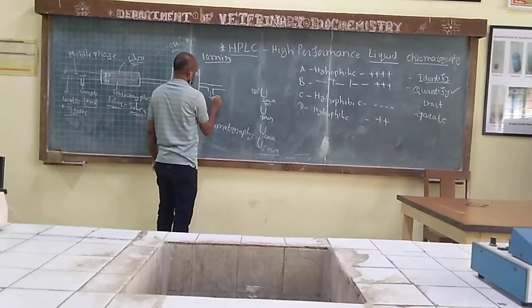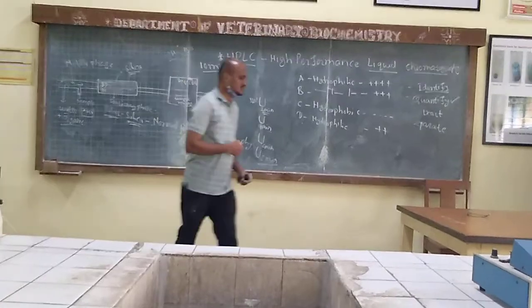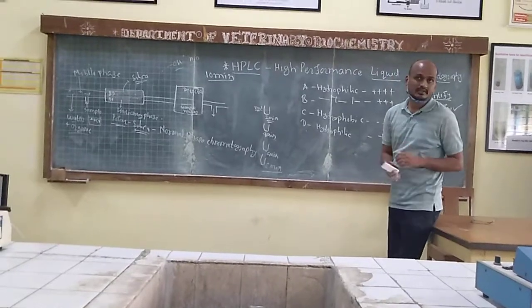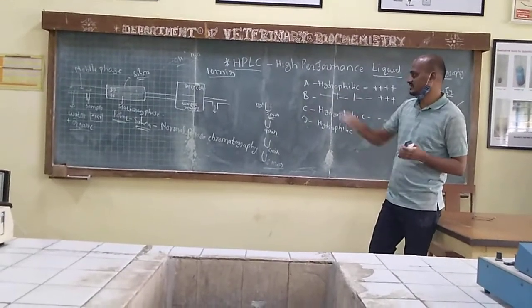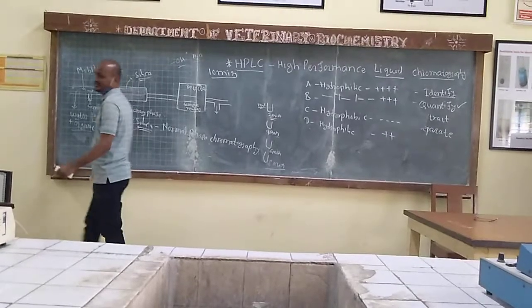Now this is a separation. Separation here it has been done. So my question is, we have collected 2 minute sample, 4 minute sample, 6 minute sample, 8 minute sample. Okay, 4 samples we have collected, and we have 1000 molecules. Out of this 1000 molecules, we are just concentrating on first ABCD molecule, right?